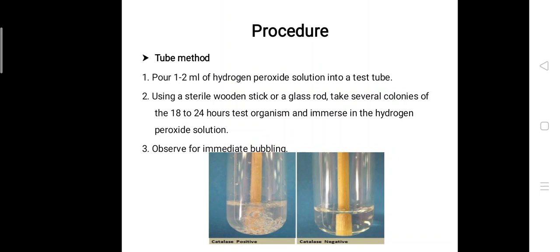Then with the help of a sterile wooden stick or glass rod, take a colony of 18 to 24 hours old organism and mix it in the hydrogen peroxide solution.